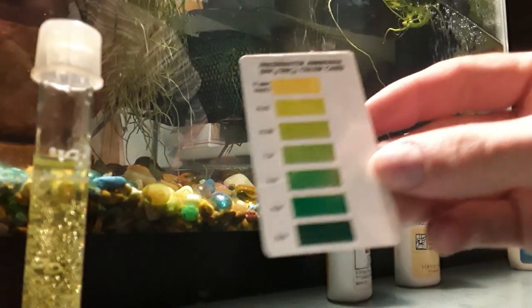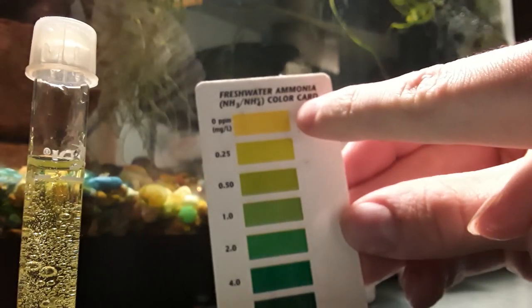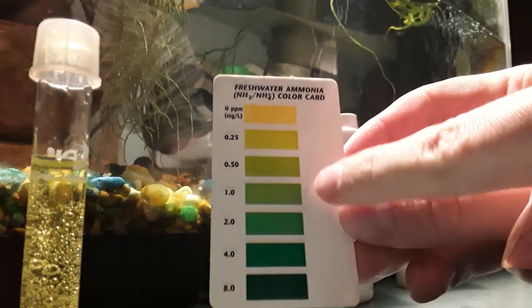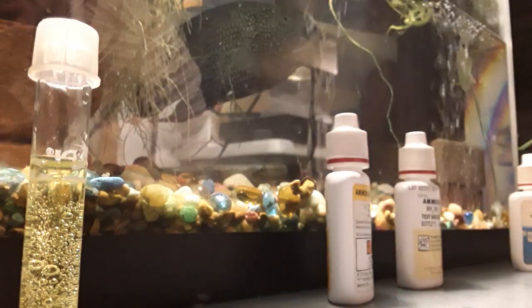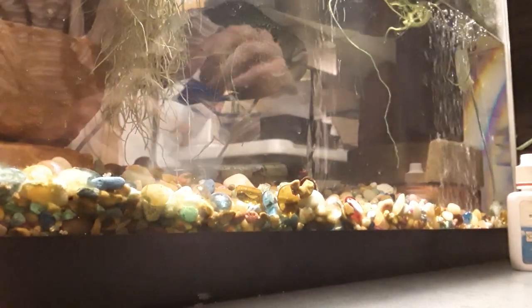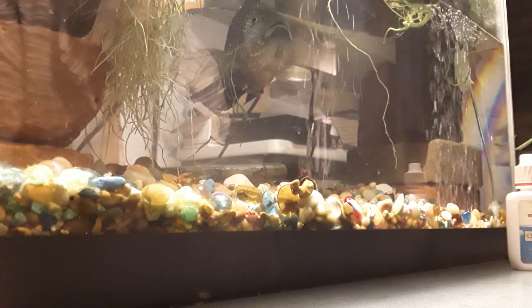It has little or no ammonia parts per million. It's showing yellow, which is nothing. If it was a little bit green, there's no big deal. If you get up there into the darker greens, that's when you have a problem in the aquarium. But this test came out perfect. I'm going to put that off to the side with my other test tubes and put these tests back in their box.